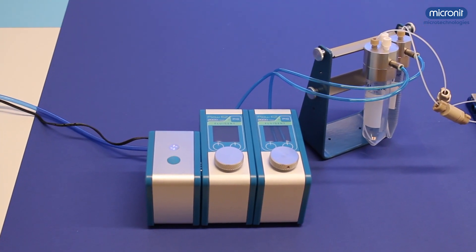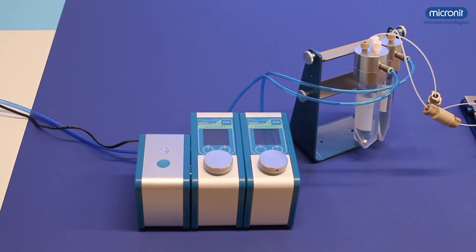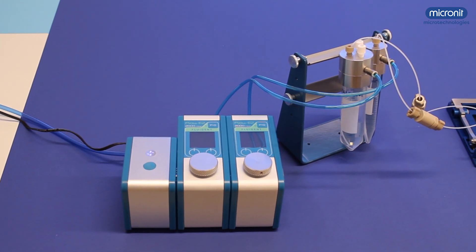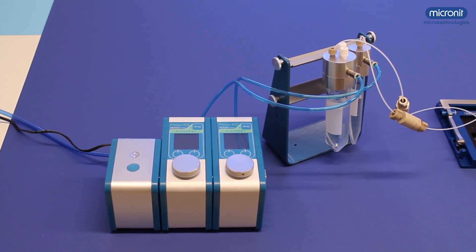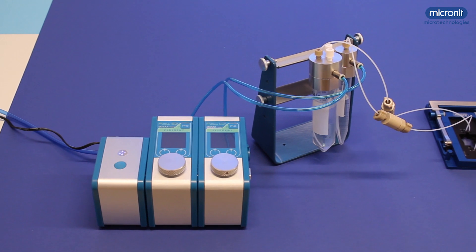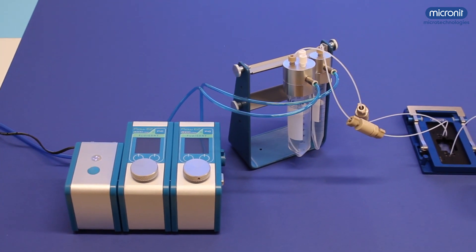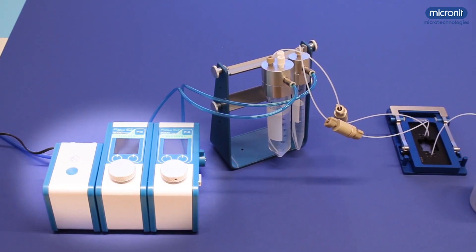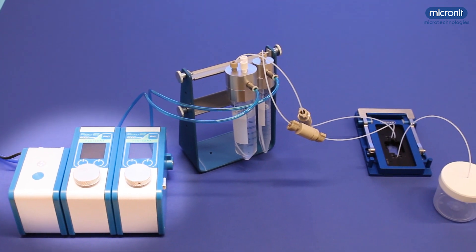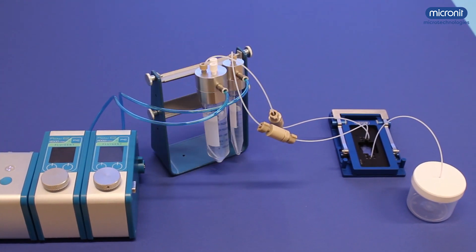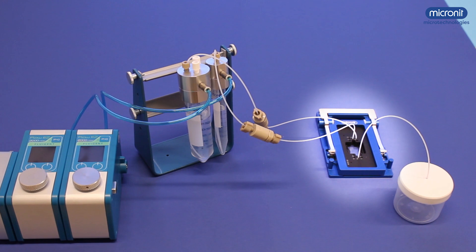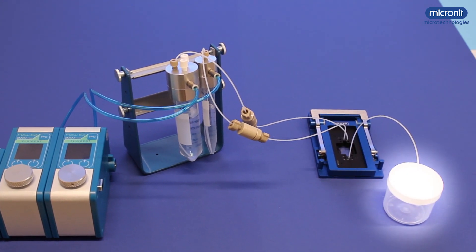This is the modular droplet generator setup, and this is what we will be working on today. The modularity of the system means you might have some other components than these, but this is a setup I like very much. Here you see a pressure controlled pump from Fluigent, fluid reservoirs, filters, the chip holder with the chip, and an emulsion reservoir.